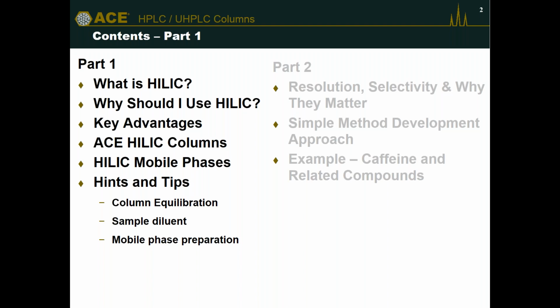What are the advantages with HILIC as a technique, but also, just as importantly, what are the disadvantages? What are the things we should watch out for? I'll also speak about some of those. I'll talk about different types of HILIC columns that are available. Again, speaking to many practicing chromatographers and scientists around the world, it's interesting that many people don't realize the different types of HILIC columns that are available, and I'll talk a little bit about that today too.